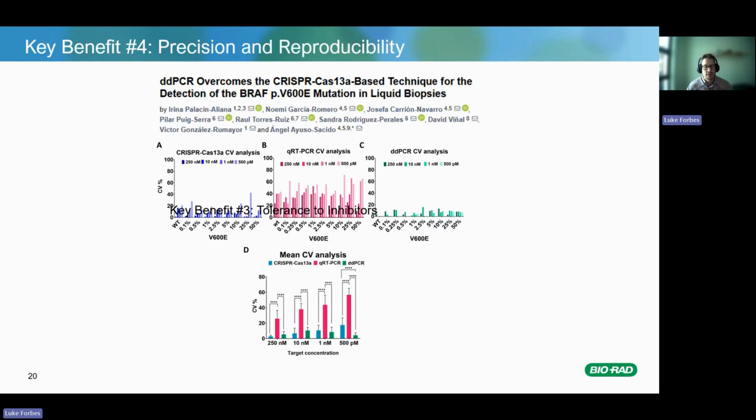And then the fourth and final benefit that we're going to look at this afternoon. In this case, we're looking at BRAF. So cancer is obviously still a leading cause of death that's plaguing many populations, and scientists are finding a lot of genetic changes, mutations, that are causing and driving these cancers. One of the most important ones is BRAF, which helps control cell growth. So mutations in BRAF can make these cancer cells continue to grow and spread at really fast rates. And there's a lot of BRAF mutations, I think over 200.